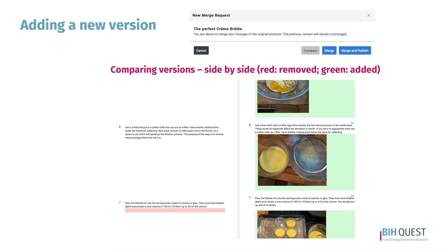Sometimes it's necessary to create a new version — maybe your published text version needs a new video or pictures. You want to know how these versions differ, especially when keeping a log of a developing protocol. You have options to compare and also to merge certain protocols. In compare mode, the old protocol appears on the left and the new one on the right — things that have been removed are highlighted in red and things added to the new version are highlighted in green.